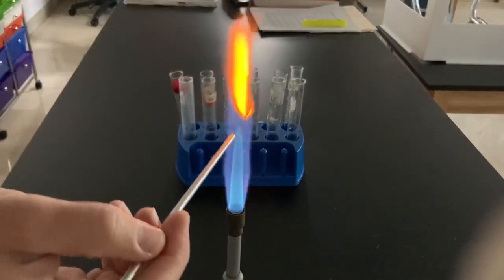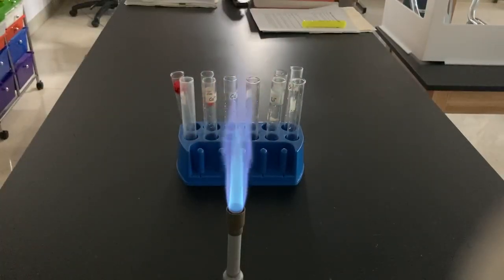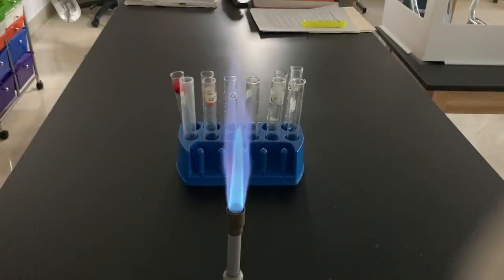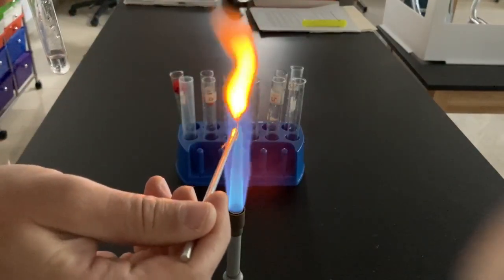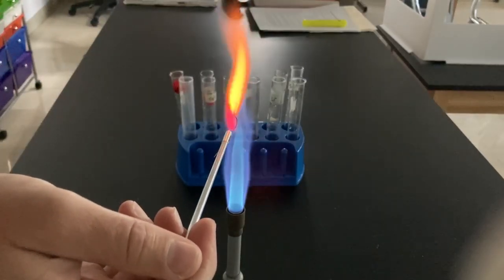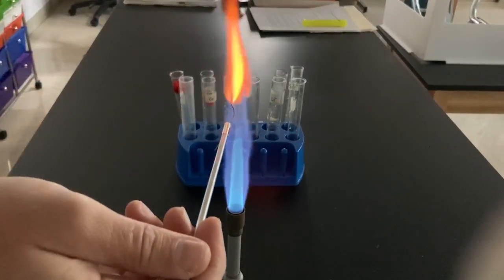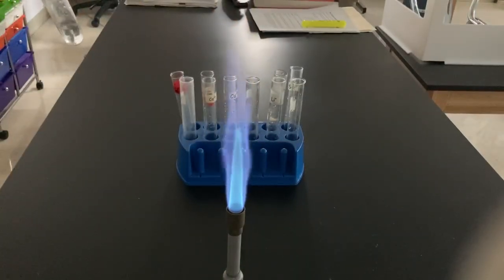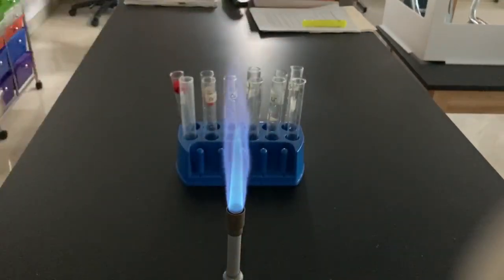Clean our nichrome wire one last time. And unknown B coming up. Here is unknown B. Let's try unknown B again. One more time — I'm not really seeing that color I expect. It's there a little bit, maybe. You've got to look real closely. Maybe I'll try it once more. Yeah, there we go. And that was our flame test lab.